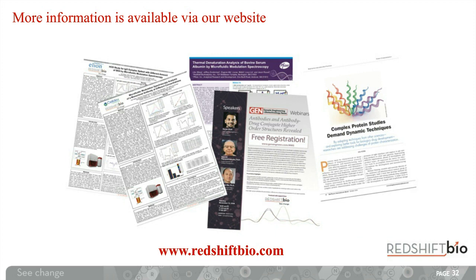And as I've discussed, it can be used in order to look at your sample's aggregation profile or process. We could use it, again, with the similarity analysis to look at biosimilars or to look at batch-to-batch reproducibility, as we did in this particular example. And there are a really wide range of other applications as well.